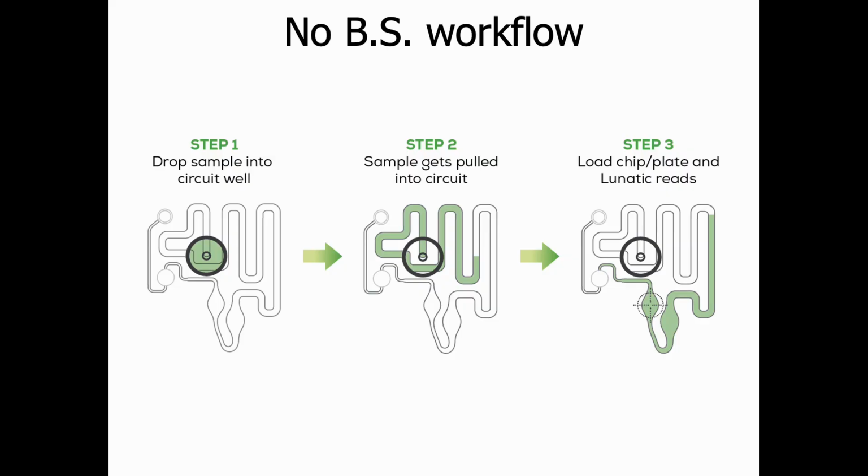Then, you load the plate into the instrument, which reads the empty microcuvettes to eliminate any absorbance contribution from the plastic. Then, a pump applies a small vacuum, which moves the sample into the microcuvettes for reading.